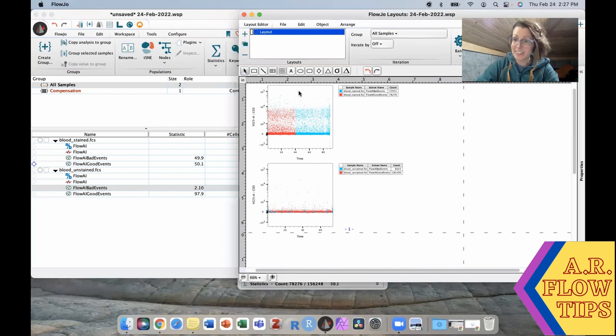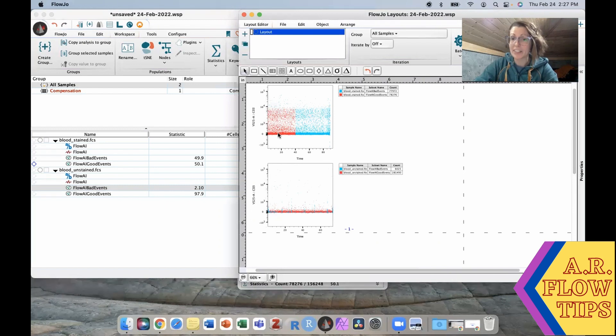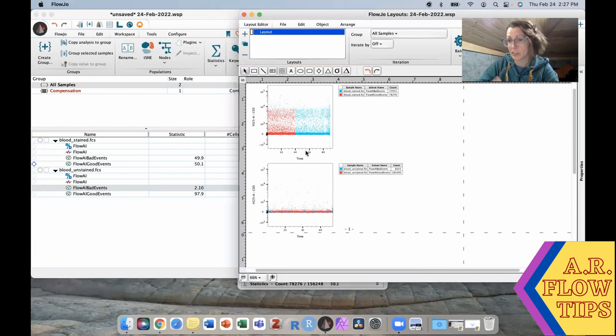This is what you would see on a sample that generally did not run so smoothly. However having not run this, you would have analyzed this entire sample and it may have affected your output in the end.